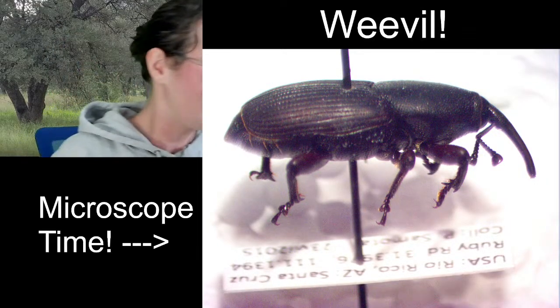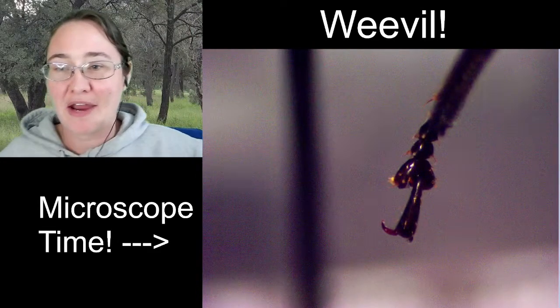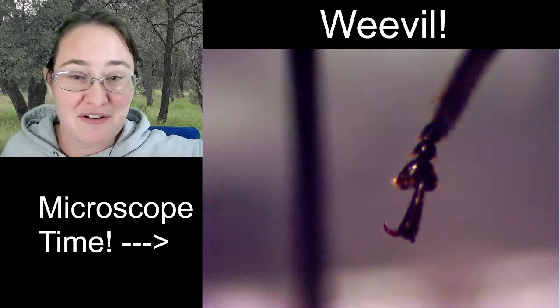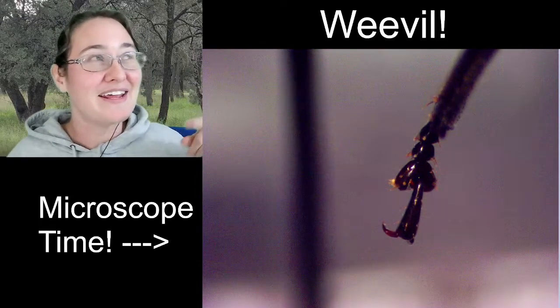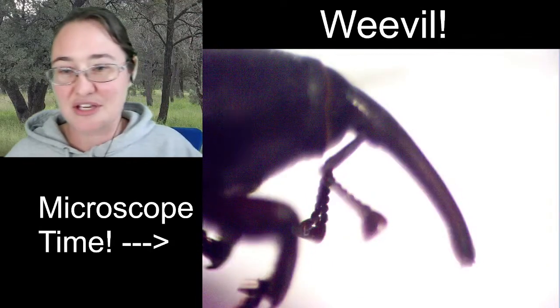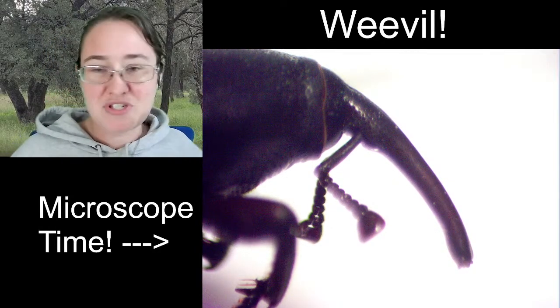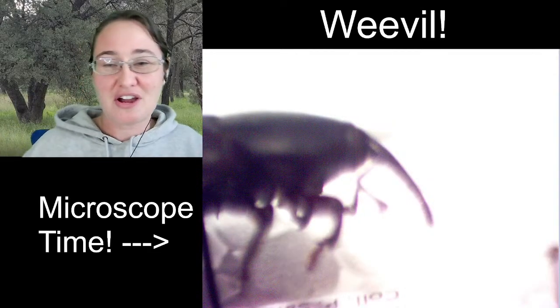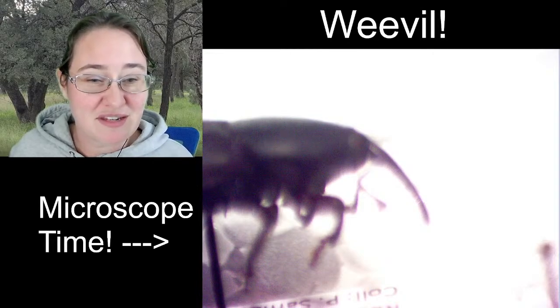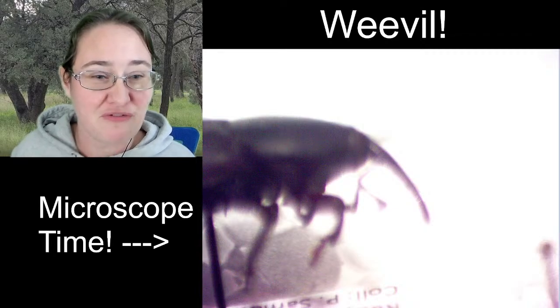It's got these really, really cute tarsal claws here. They're what we consider 4-4-4, because it looks like there's four segments, but there's actually a hidden fifth segment. And he's got these really cute clavate, clubbed antennae. So that's option number one. He's fairly large, a big black weevil. I believe it's a sisal weevil. I was doing a little bit of identification before the live stream today.